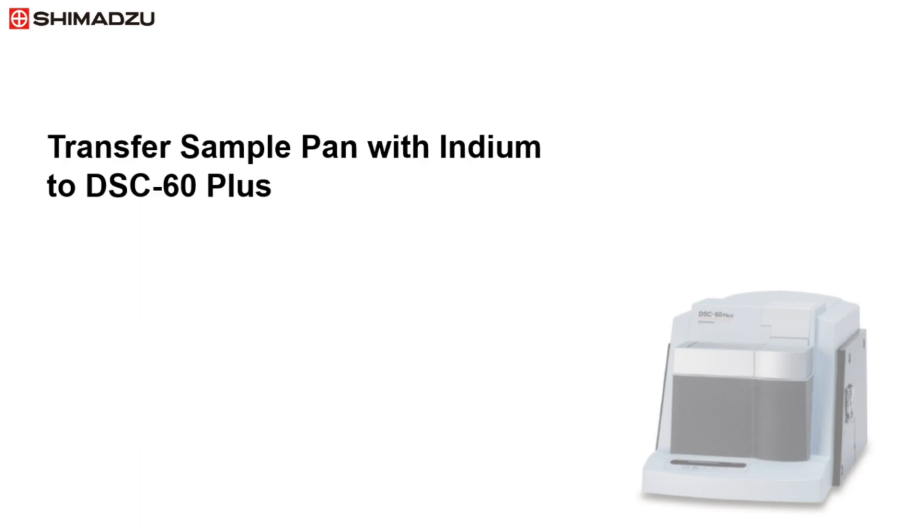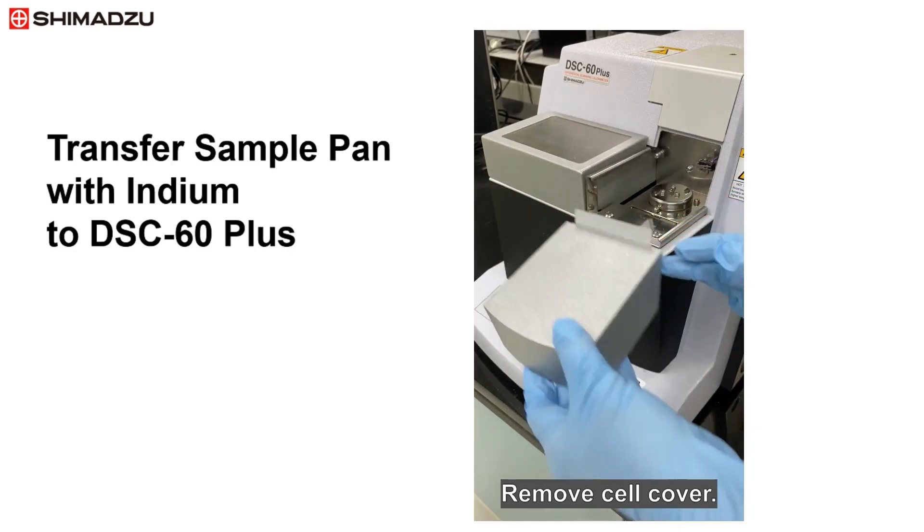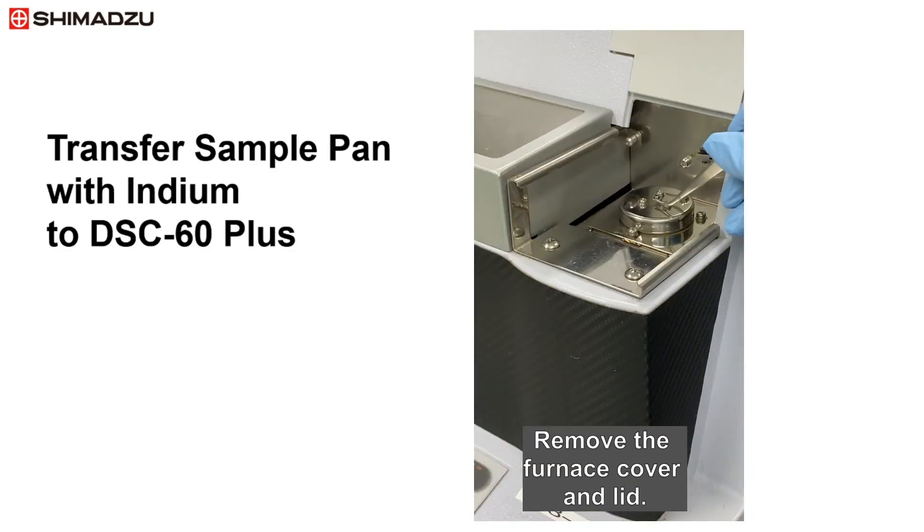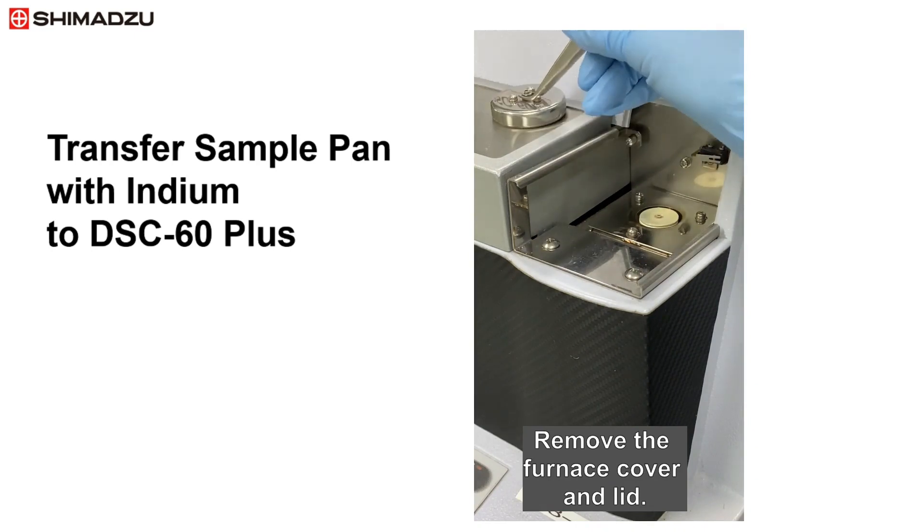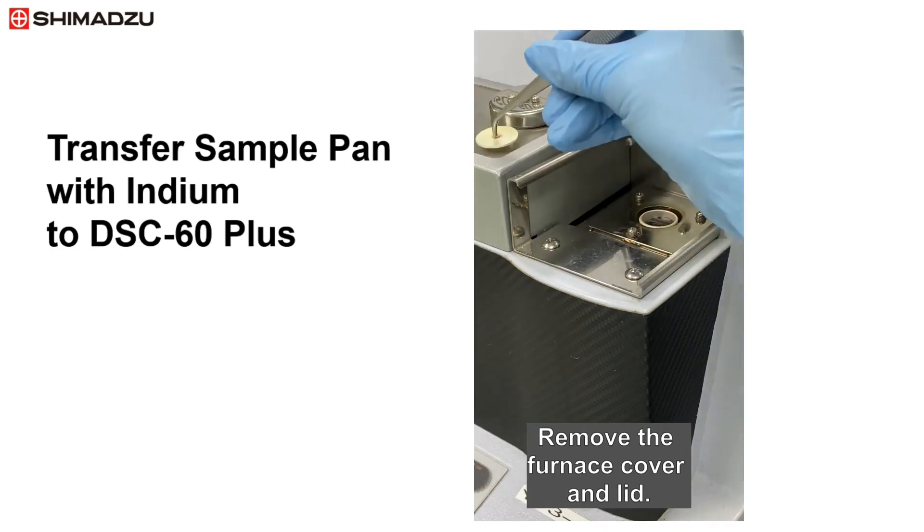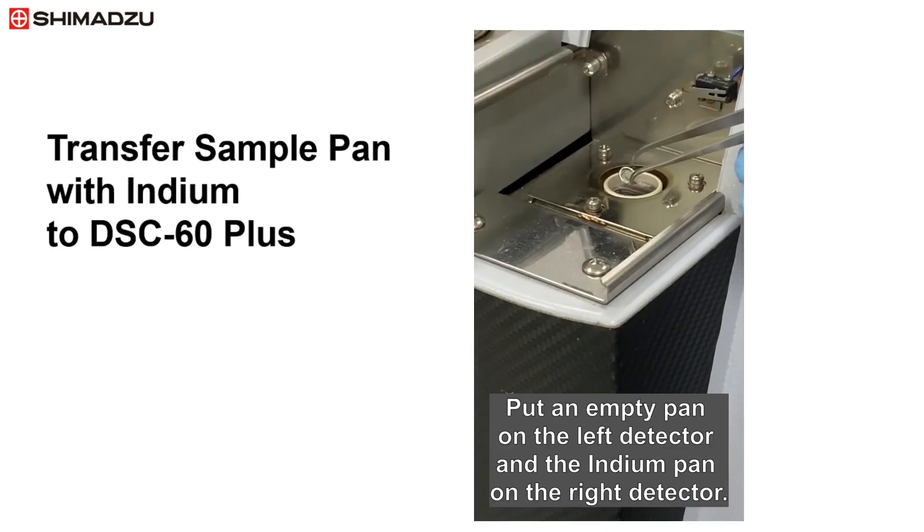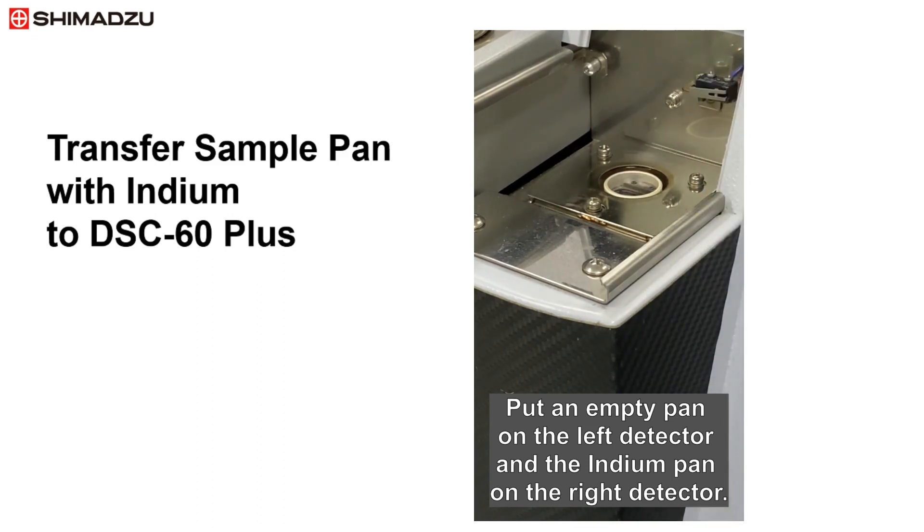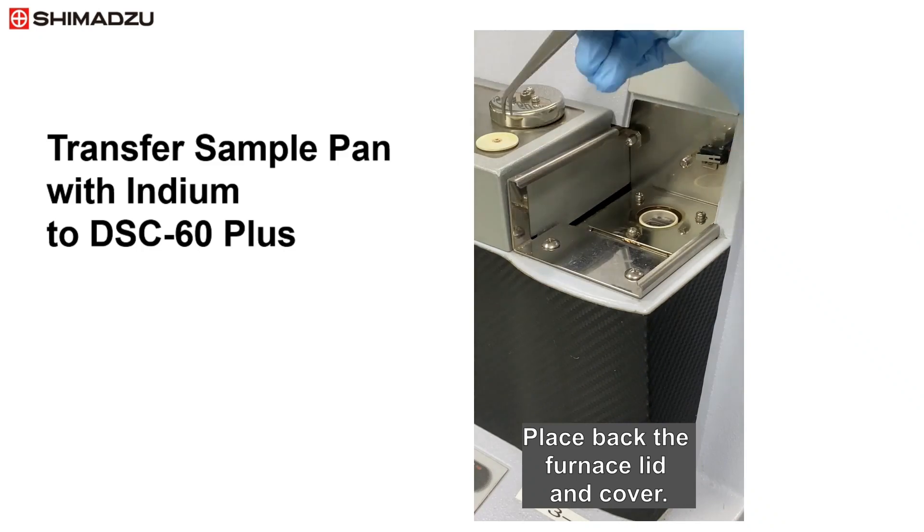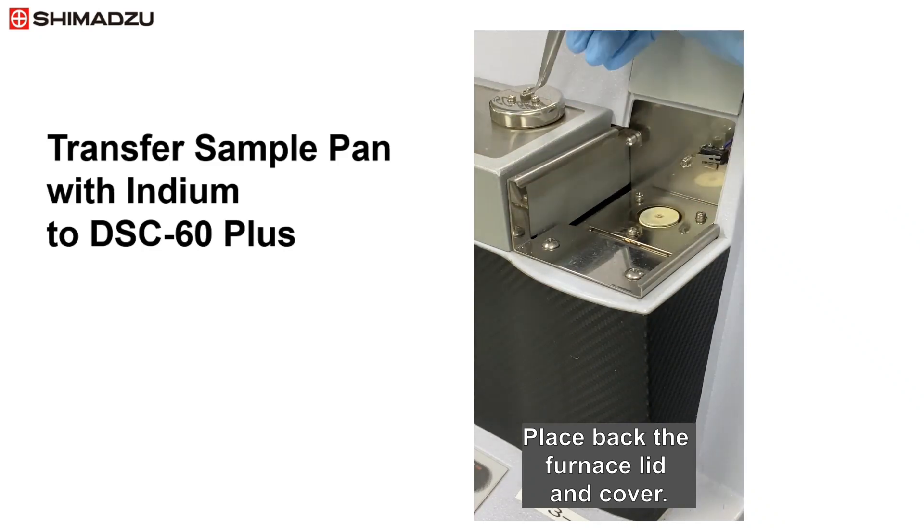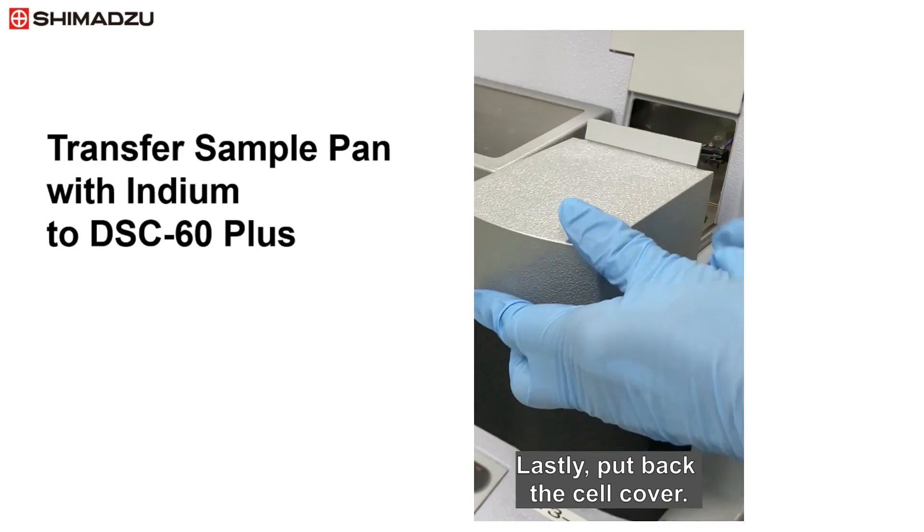Next, the sample pan with indium is transferred to the DSC-60 Plus. First remove the cell cover, then remove the furnace cover and lid. Put an empty pan on the left detector, next put the indium pan on the right detector. Place back the furnace lid and cover.